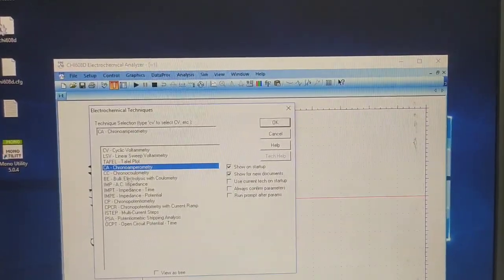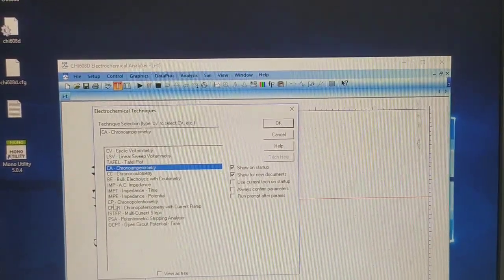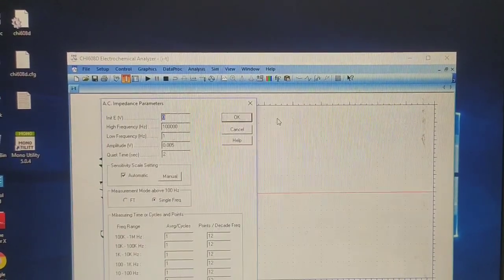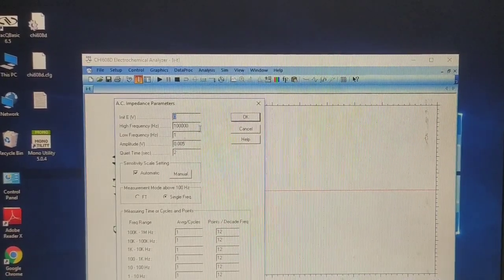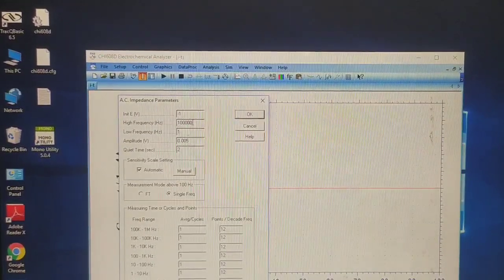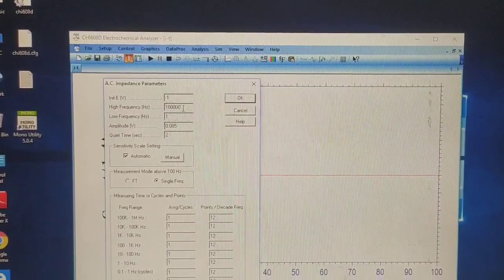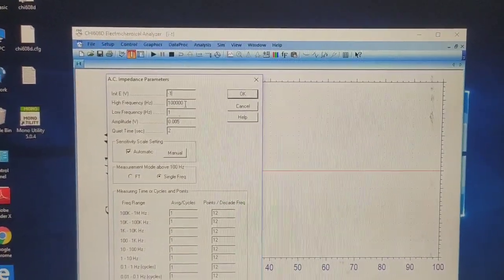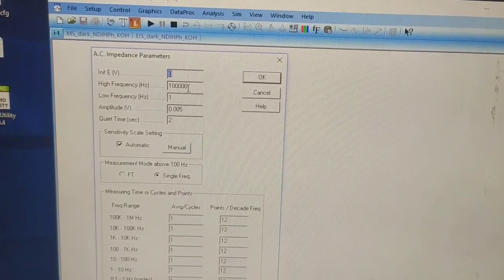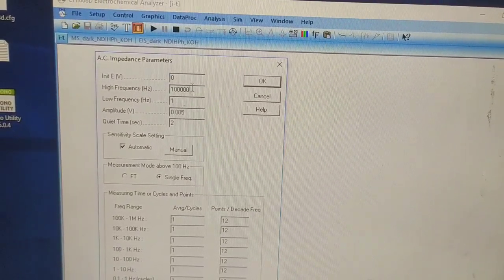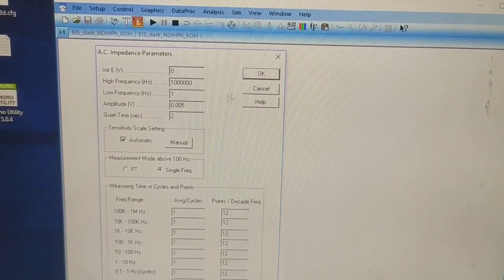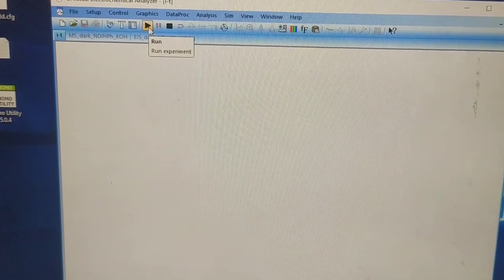That is impedance — AC impedance. Let's take AC impedance; by this we can record the EIS experiment. Now let's take the initial potential at 0, and we need to make the high frequency 10 to the power 6 — just add one more zero here and press OK. Let's start.